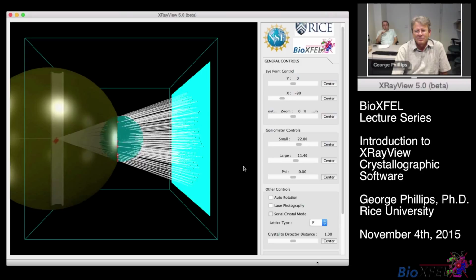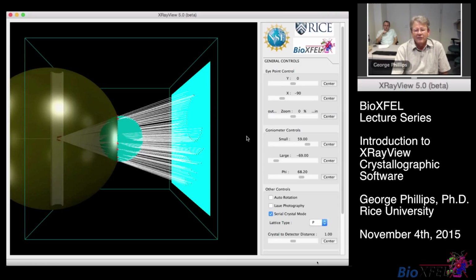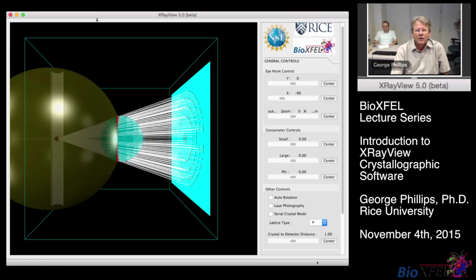But it's possible. When you're at the beamline trying to figure out if you're getting anything or not, if it's a tiny crystal, you often won't see such obvious rings. You might need to integrate a number of different views in order to see anything. So where am I supposed to go to turn on the integration? Go to options, autoscatter. Options, autoscatter, right, okay.